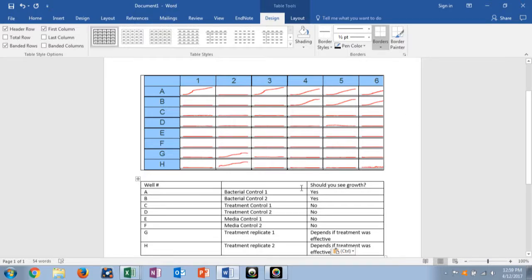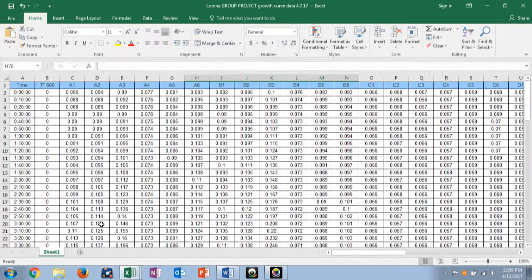Now these don't correspond to the group's data that I'm going to show you. For them, I still need to get them this little chart. However, this is just an example. But I did promise them that I would make their data a little bit more user-friendly for them, because I'm late giving them their data to work with.